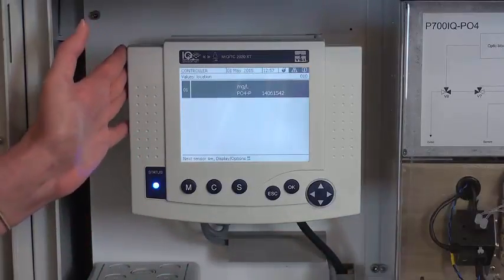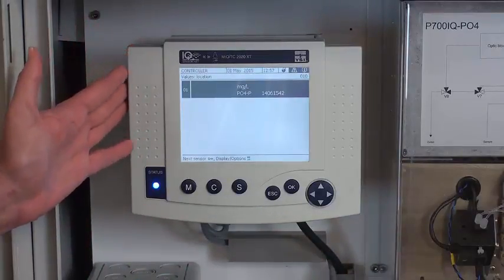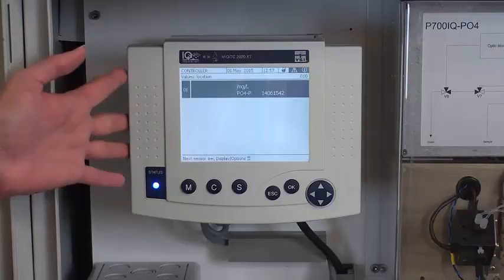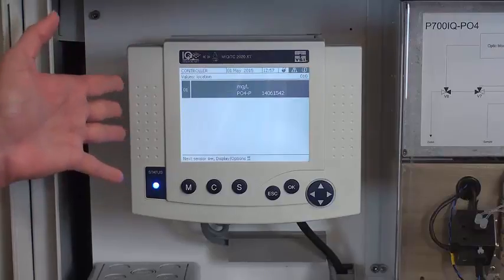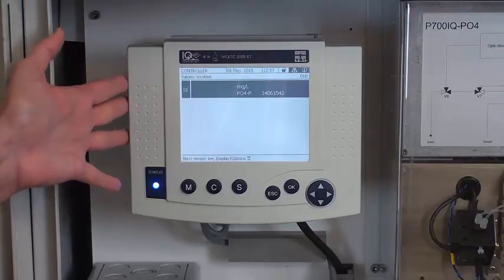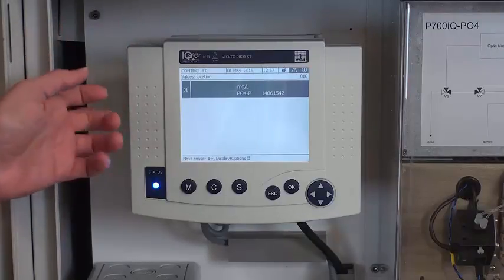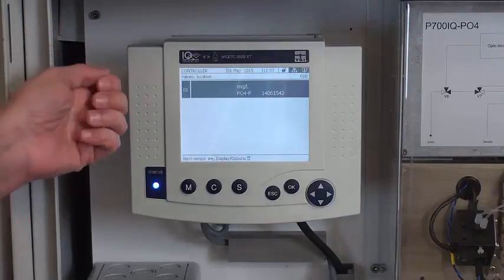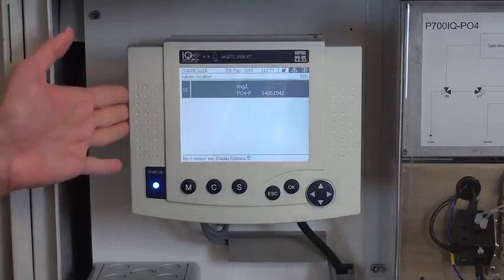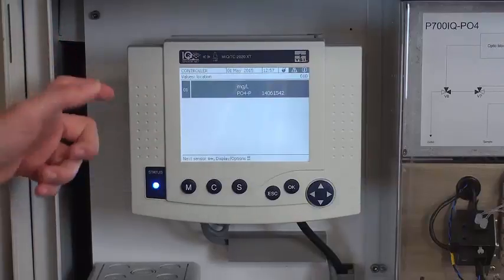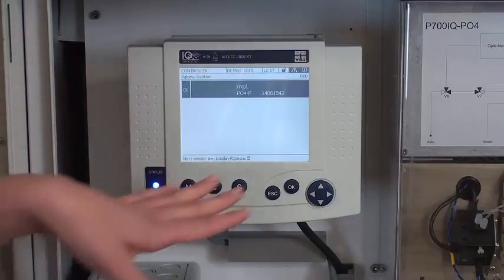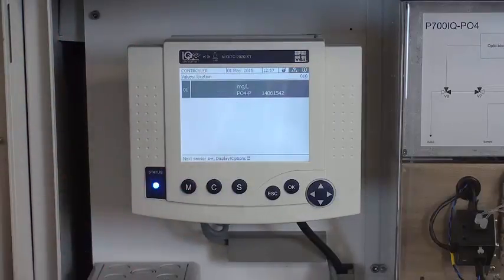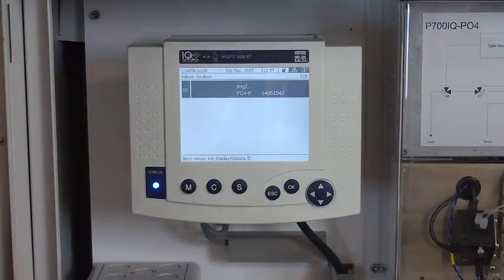I have a 20-20 IQ display in here at this time. This can be removed, but I've connected it into my analyzer so I can easily adjust the settings inside the analyzer.